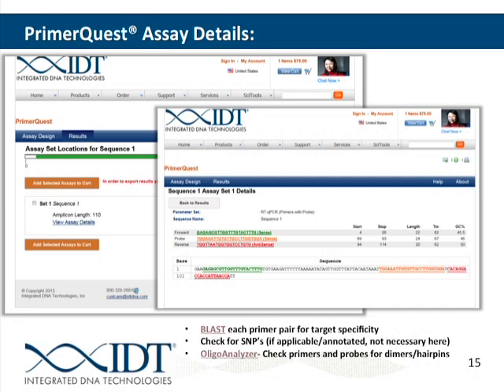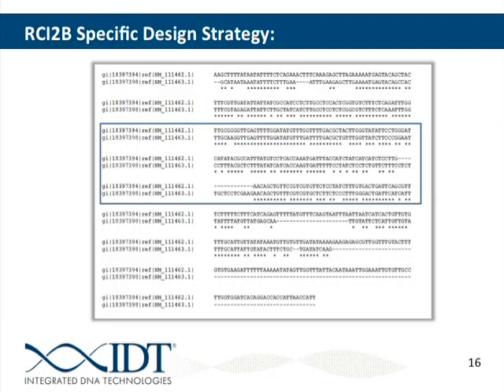And that gives you the ability to manipulate it some more. So there, we can save this. We can highlight regions which look like they're going to be unique or overlapping and try to get an idea.